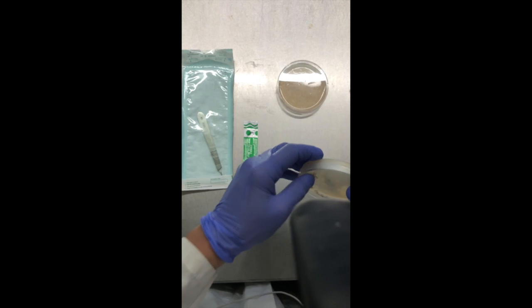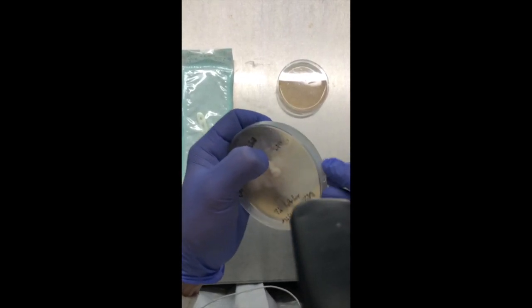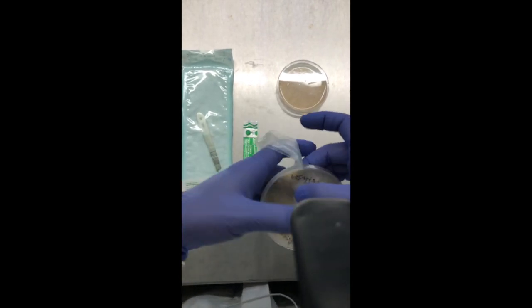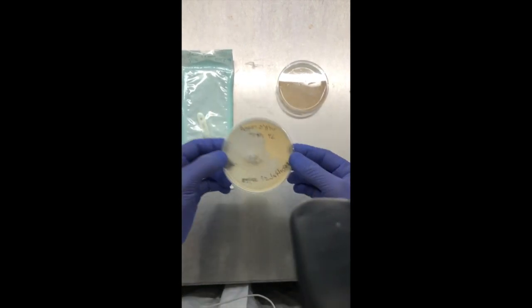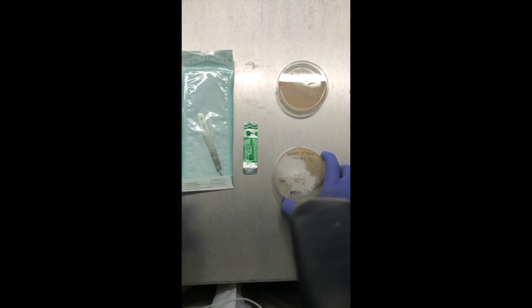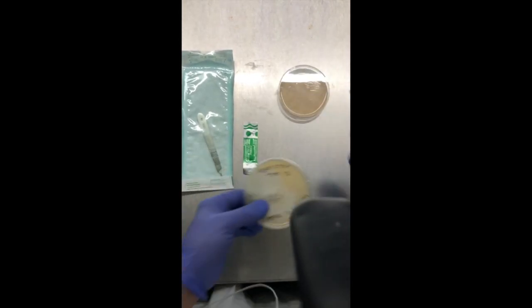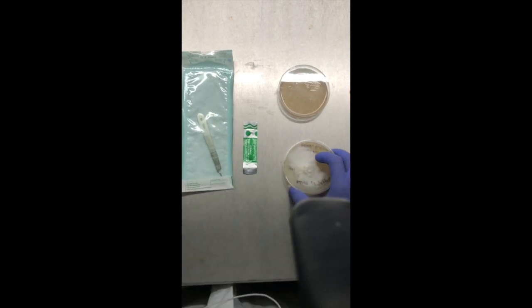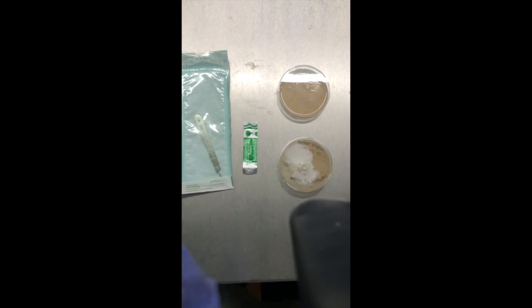The first thing you want to do when doing your plate transfers is to take off the parafilm. I noticed this plate was labeled on the lid, which is okay as long as you're only working with one culture at a time. Normally I label on the bottom of the agar just so if the lid gets misplaced you don't mix up your cultures.